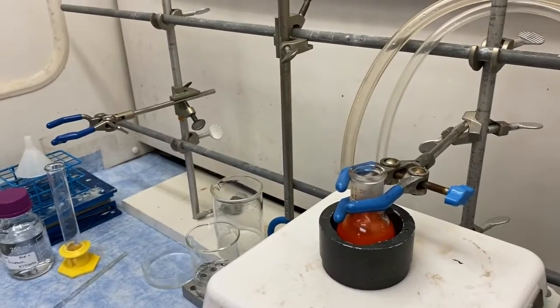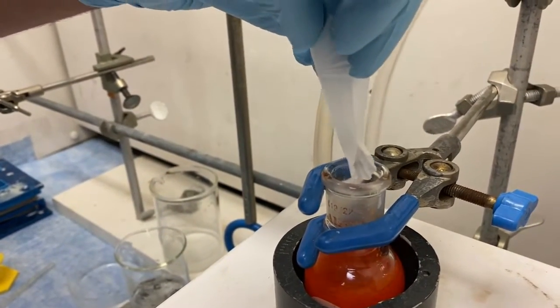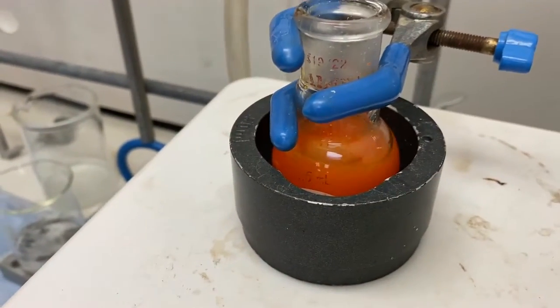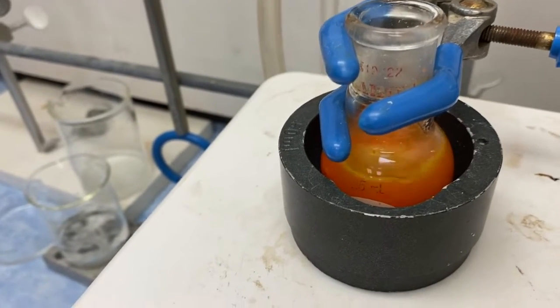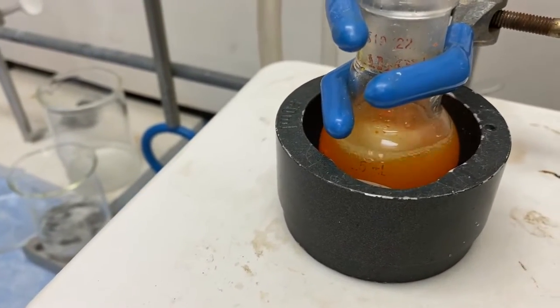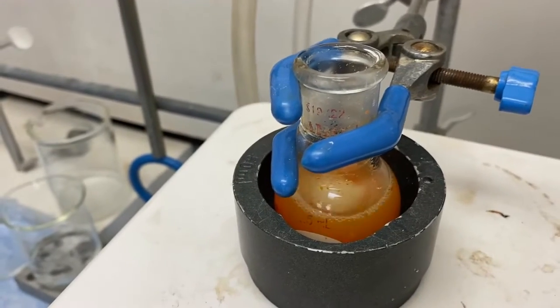Roberto, I'm sorry, is going to go ahead and add the sodium borohydride. It's going to add the hydride to the double bond. As a result of that, we're going to lose conjugation, and so you can see how the color is getting lighter and lighter. Once we break conjugation, this is going to take about a minute or two, and we're forming that intermediate ion. That intermediate ion is non-conjugated and colorless. So we're going to keep adding sodium borohydride until all the orange is gone.